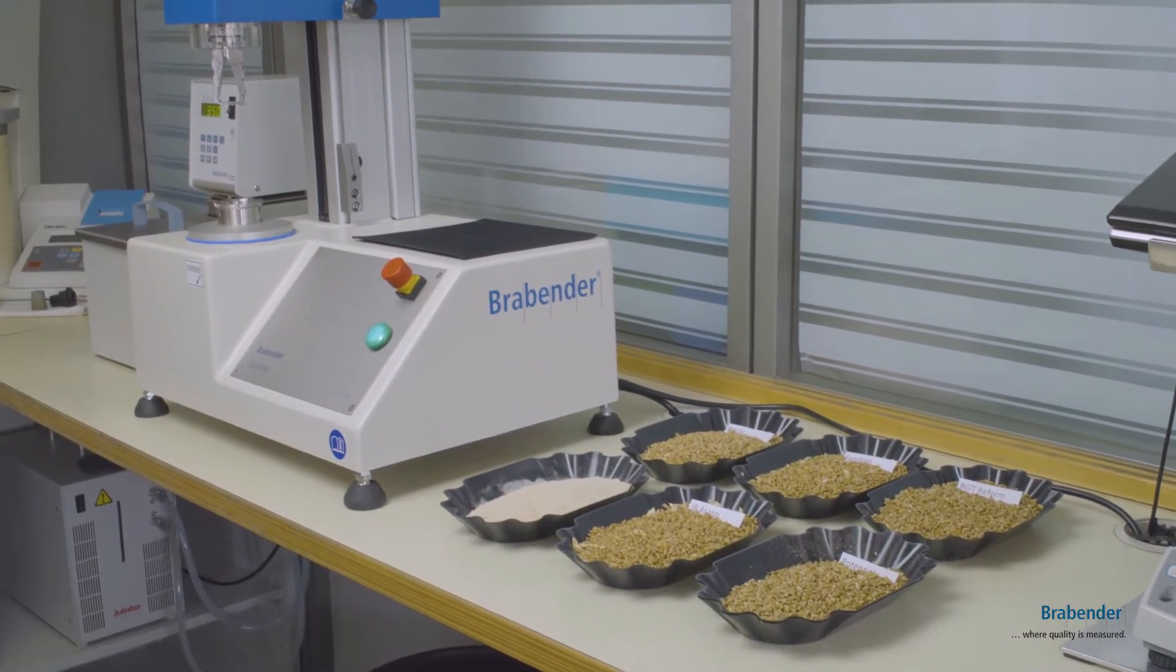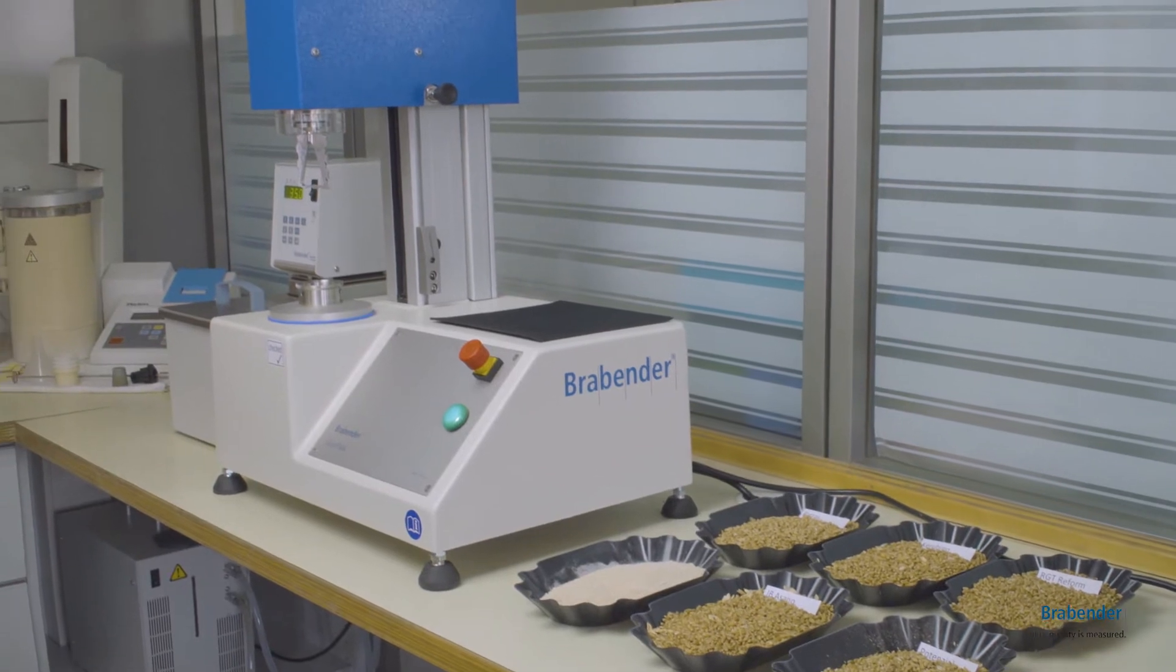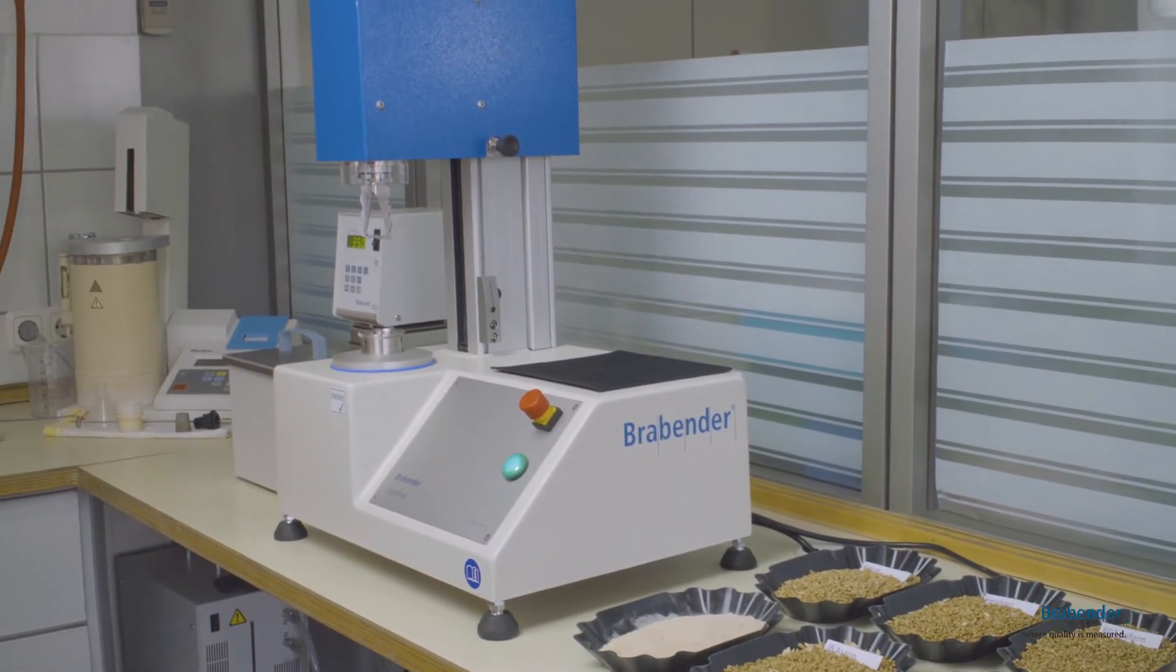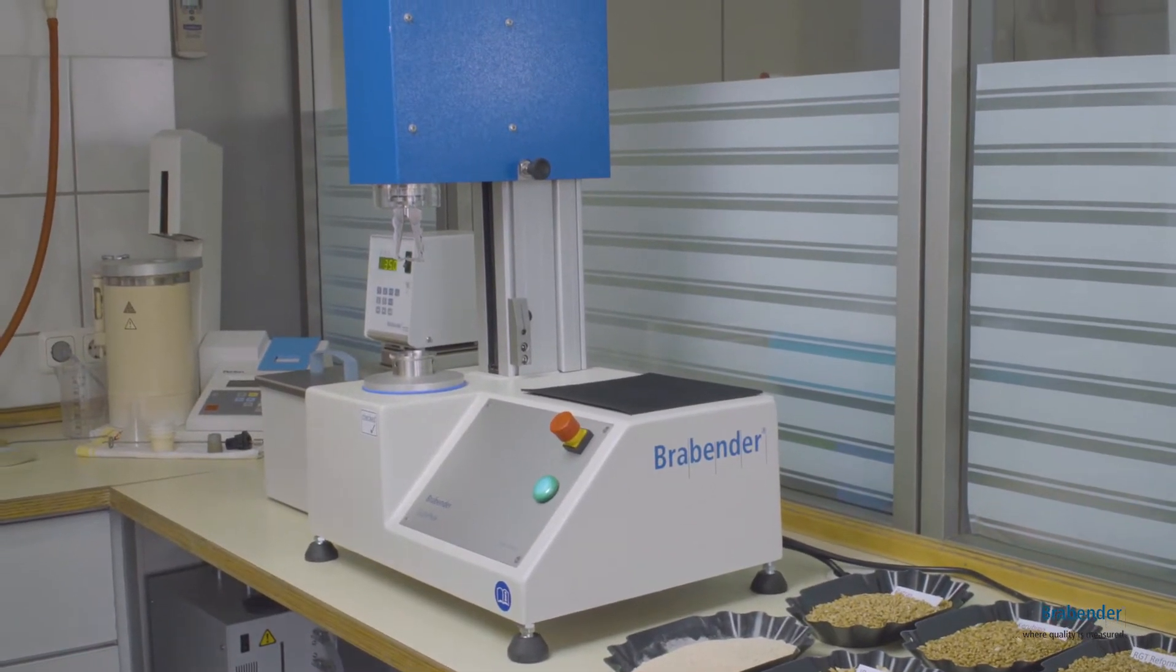The Brabender Gluto Peak measures the aggregation properties of the proteins in a sample to describe their technological and functional qualities.